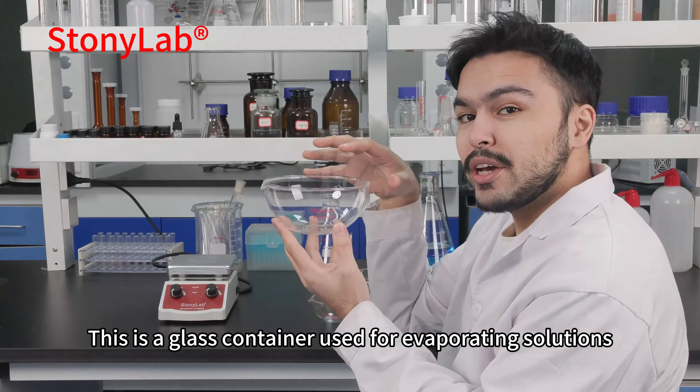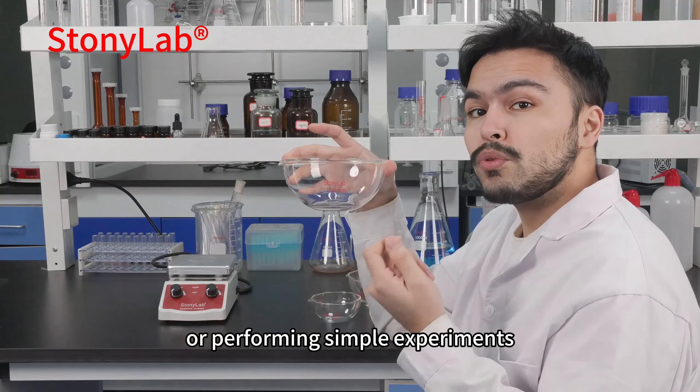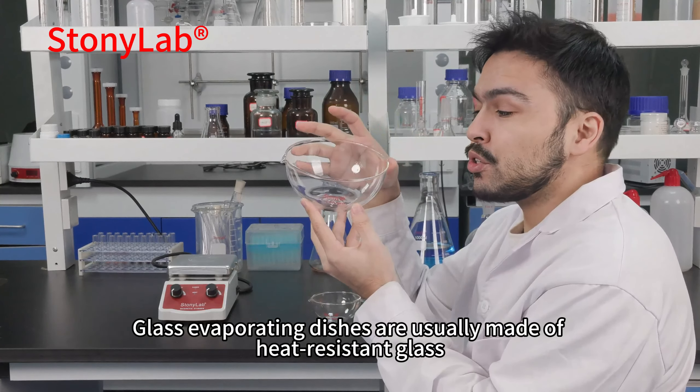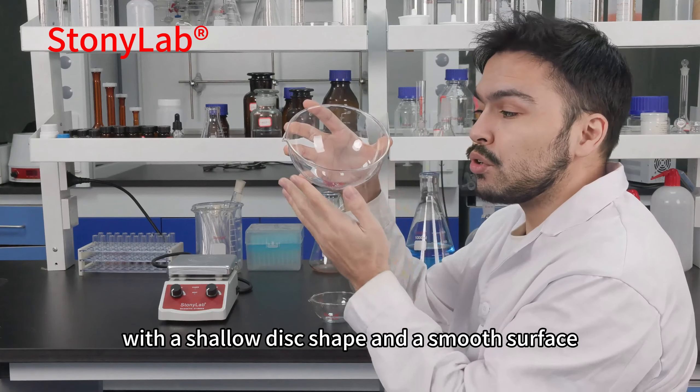This is a glass container used for evaporating solutions, precipitating crystals, or performing simple experiments. Glass evaporating dishes are usually made of heat-resistant glass and have a shallow disc shape and a smooth surface.